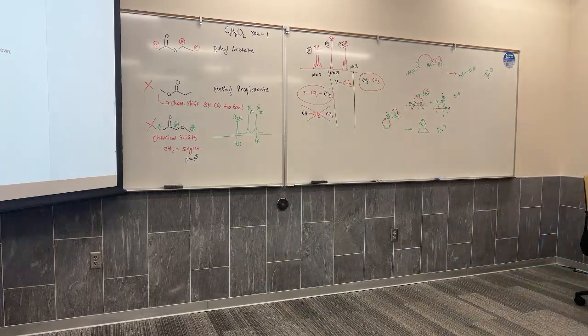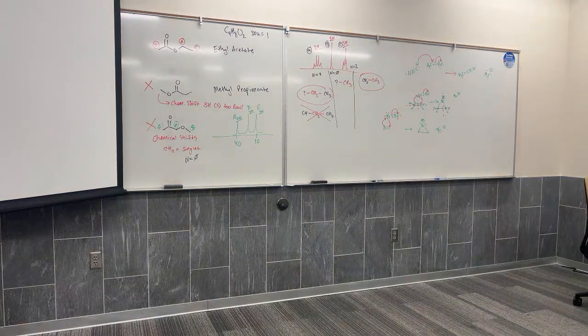Okay, shall we move back to spectroscopy, or do you guys feel strong enough on this that you want to just start your midterm review right now? Okay. All right, then, do you want this example where we take the NMR and the IR of a compound with its chemical formula and we derive the structure? Because it helps us do everything at once, which is analyze IR, analyze NMR, and build a structure. Okay. I'm going to try to find one then.